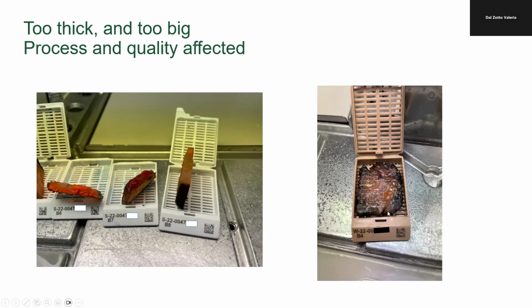Under processed means that you are not going to be able to obtain a good histologic section. So this tissue must be returned to processing, and this is going to take approximately 24 to 48 hours more than usual, and you are going to be called for this.